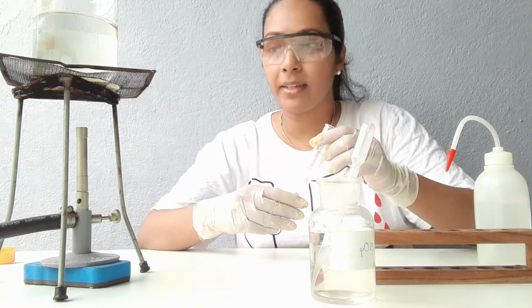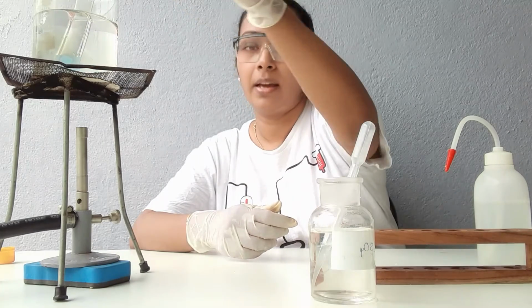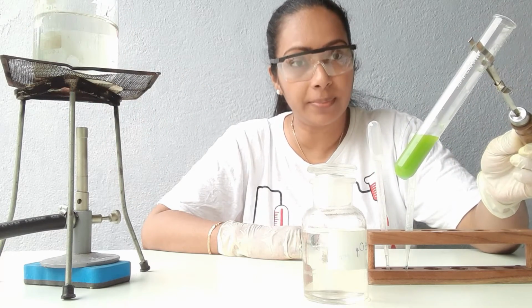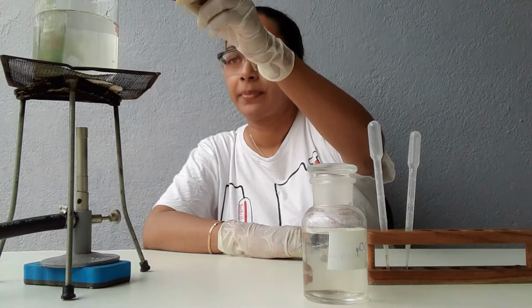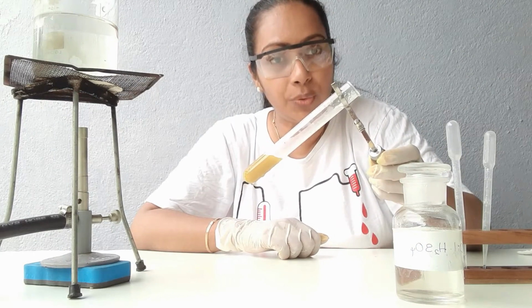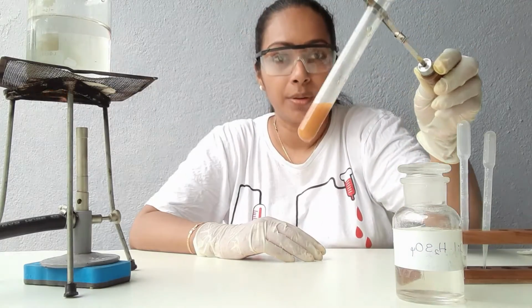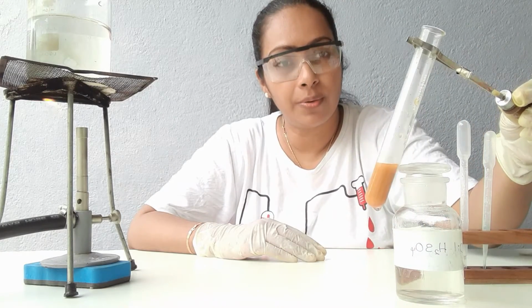Let's place this in a hot water bath and observe the color change. Color has changed from blue color into a yellowish green color. Let's leave it in the hot water bath for some more time. From green color, it has turned into an orange color. From orange, it has turned into a brick red color.